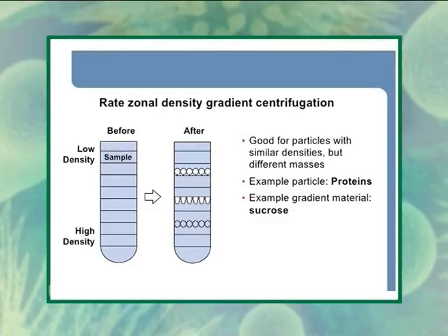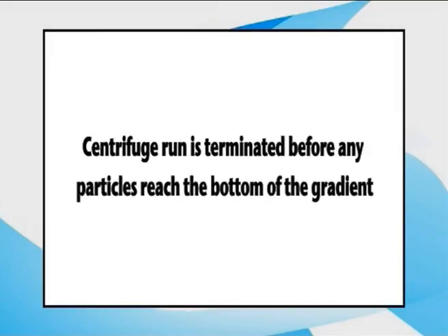Under centrifugal force, the particles will begin sedimenting through the gradient in separate zones according to their relative velocities. That is, macromolecules with the same sedimentation velocity move as a single zone. Separation of similar type of particles is based mainly on their size. Since the technique is time dependent, the centrifuge run is terminated before any particles reach the bottom of the gradient.